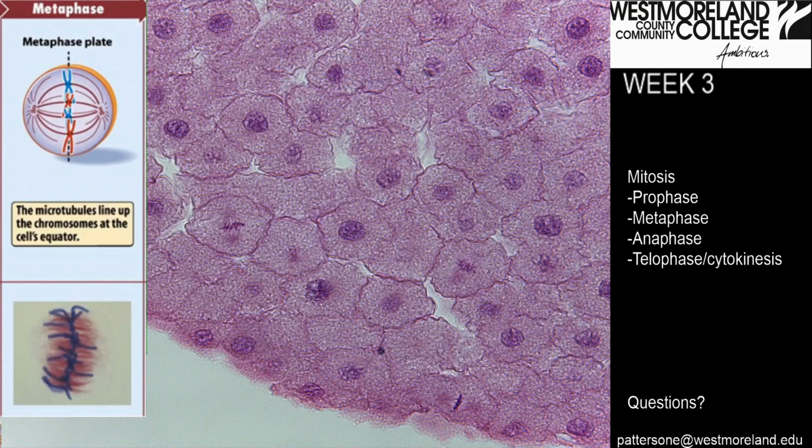Let's look at metaphase, and using the picture from the SLM, we can see how the nucleus should appear at the bottom of that image. Looking at a fish cell again, can you find the two metaphase cells on this picture? It appears to be these two.